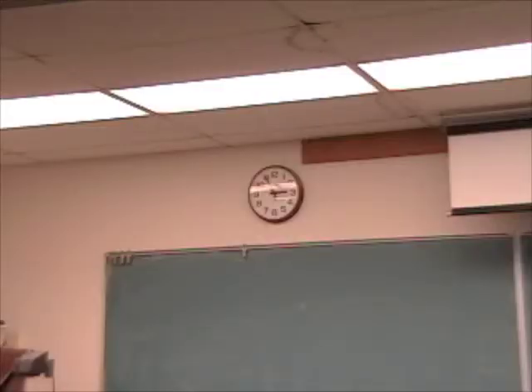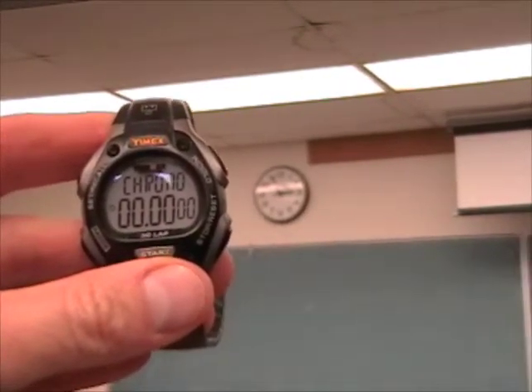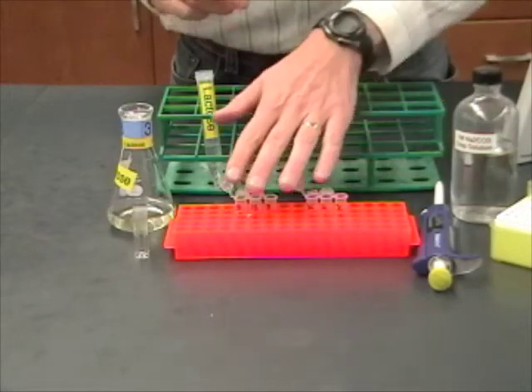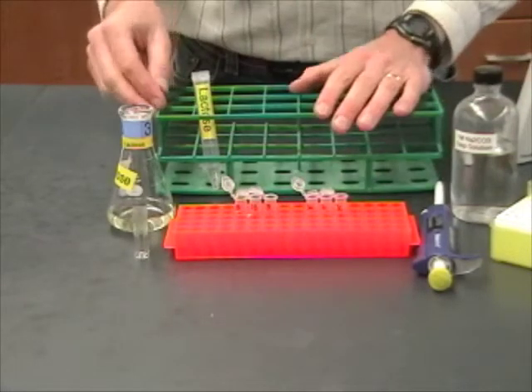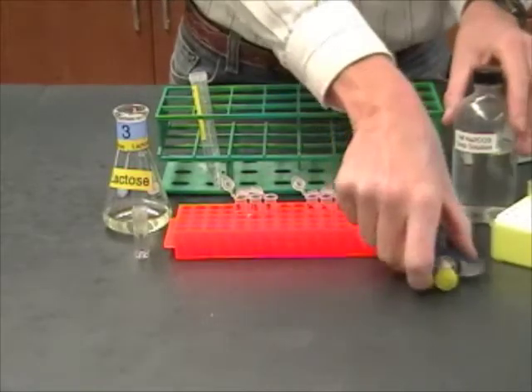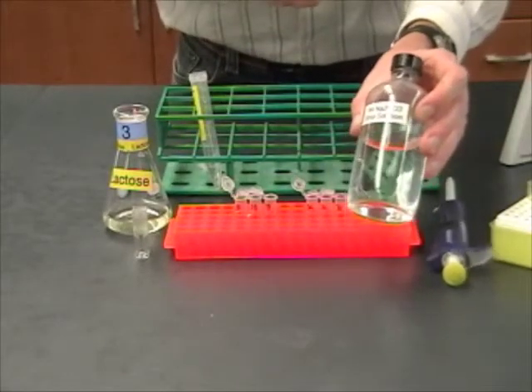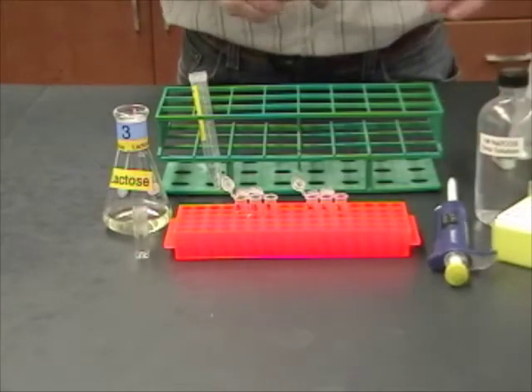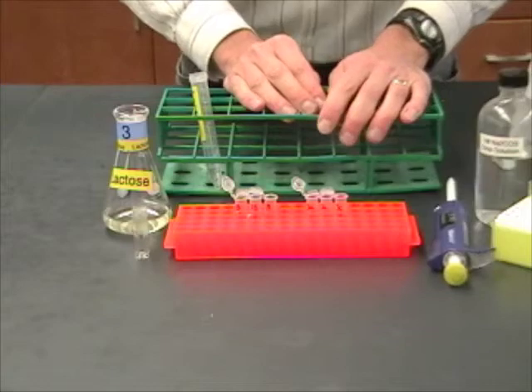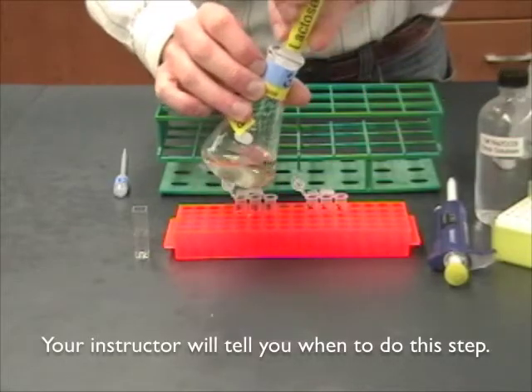One thing that's tricky about this lab is you're going to have to keep track of a couple different times. So, on the clock in the lab on the wall, you're going to want to note the time from when you add your sugars. And then, you're going to take time points every 20 minutes. But, you're also going to need a stopwatch at your table as well to keep track of the time of the individual reactions. Okay. We're finally ready to start. I've got my tubes labeled and they've got the solutions that they need in them. I've got my bacteria and my sugar ready to go. And, everybody else at my table has done exactly the same thing with their sets of tubes. Now, another thing that's important to have ready to go is we need to have our pipetter still set at 200 microliters. We also have to make sure we've got this sodium carbonate solution, which is going to be important later. Alright. So, now everything's ready to go. I'm going to check the clock on the wall of the lab and make a note of the time. Because, now, the whole table together, and your instructor will tell you when to do this, is going to add your sugars to your bacteria.